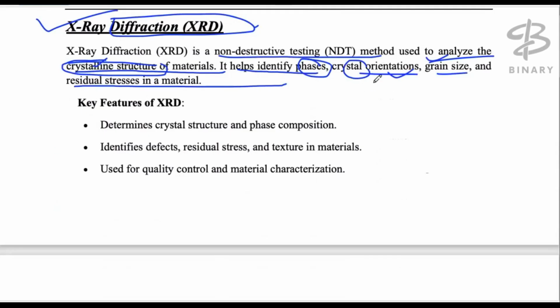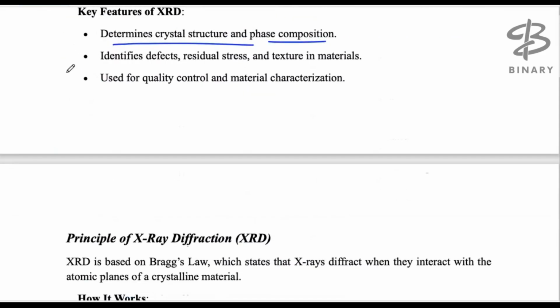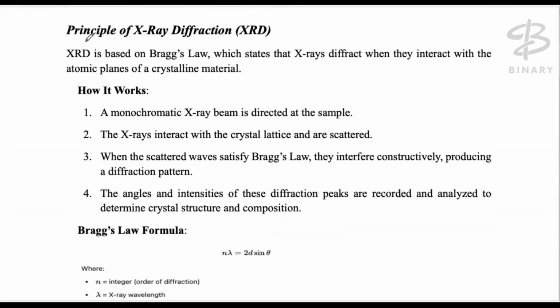the material. The key features: it determines the crystal structure and the phase composition, identifies defects, residual stresses, and texture in the material, and is used for quality control and material characterization. So what is the principle of X-ray diffraction?